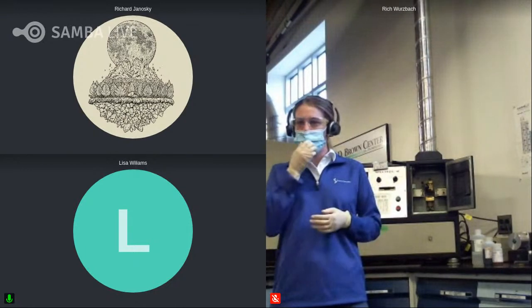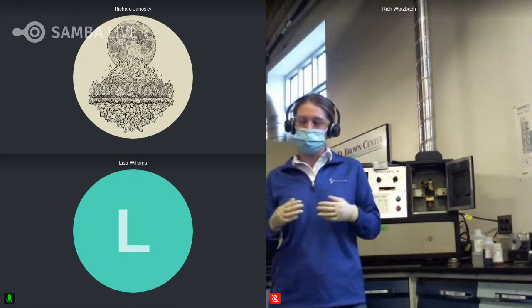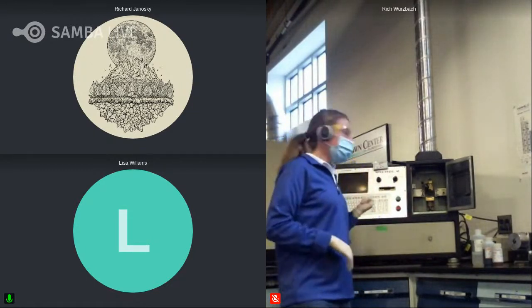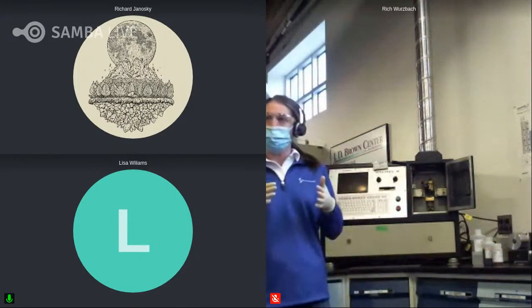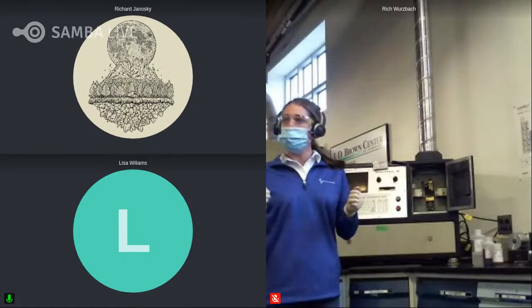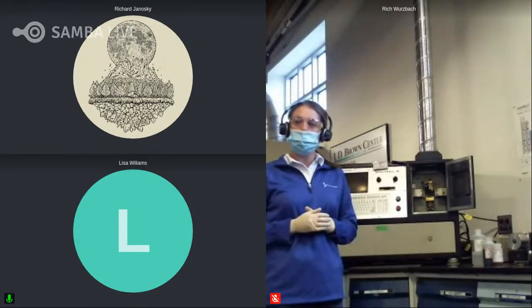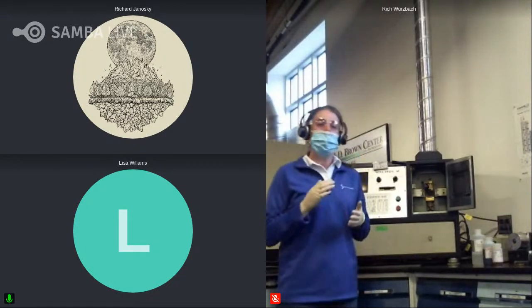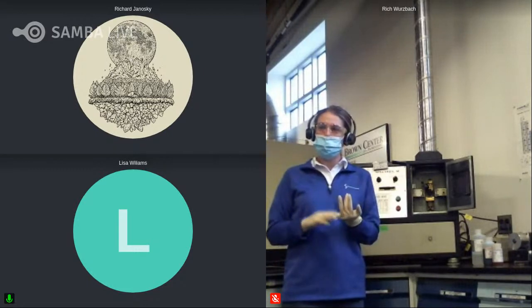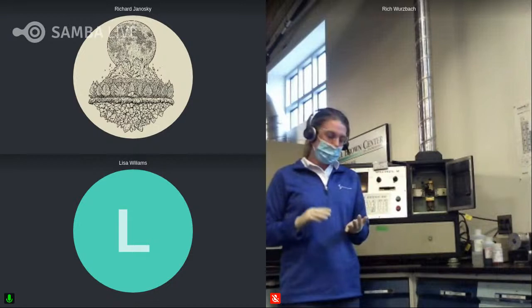I get a lot of questions about how to add this capability to your oil analysis program. I'm demoing today on a Spectroil M unit, but some of you may have a Spectroil 120. It also works on the Spectroil 122, that tower, so we can use the same methodology there. The key here is going to be sample prep and making sure that we have a good volume of sample.